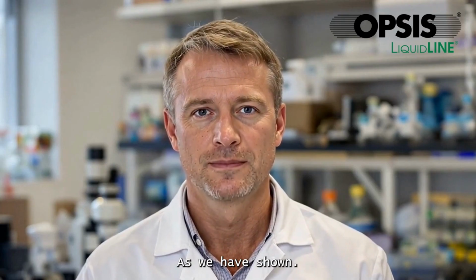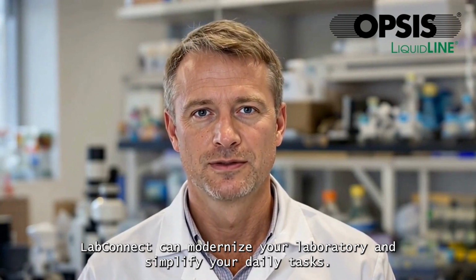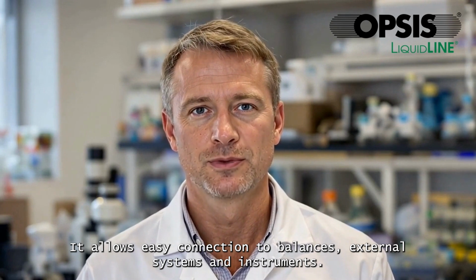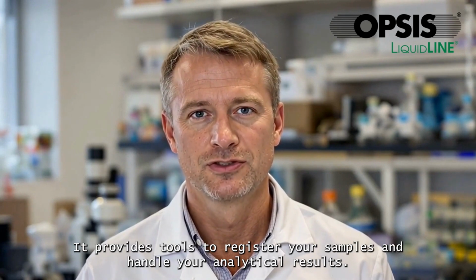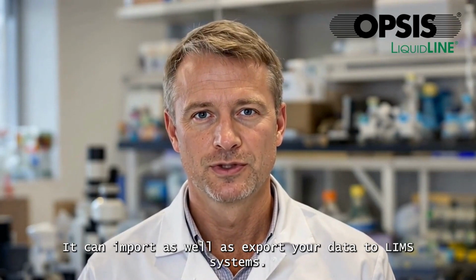As we have shown, LabConnect can modernize your laboratory and simplify your daily tasks. It allows easy connection to balances, external systems, and instruments. It provides tools to register your samples and handle your analytical results. It can import as well as export your data to LIMS systems.